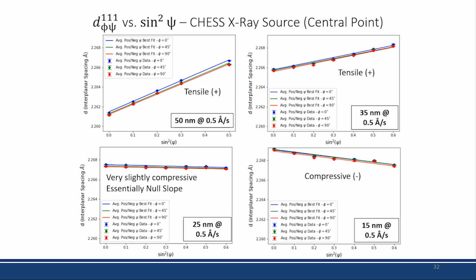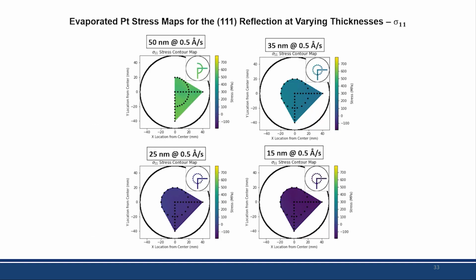This was interesting as well, where I saw these kind of level out on lab source because they were getting so low in thickness. We saw a really clear trend with thickness of film and stress, such that even an evaporated film at a certain thickness at this condition, you could see a transition point where it moved to compressive stress, which was really an interesting thing to see. And again, because I was able to take more data, we started to do mapping of stresses around the sample.